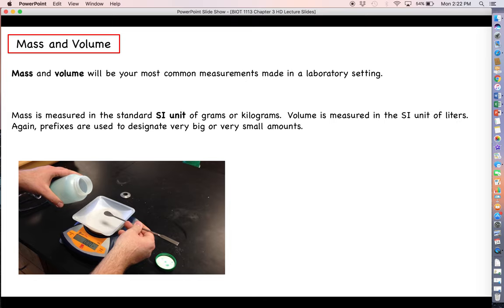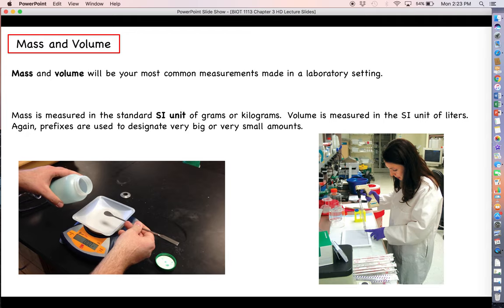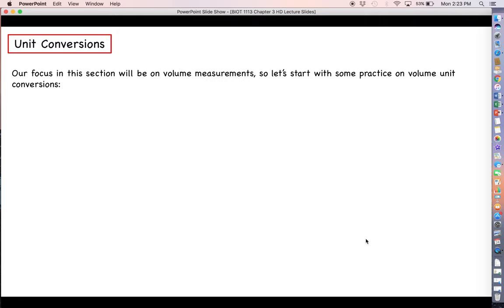Mass is usually measured by an analytical balance or other type of scale. In this picture you can see someone weighing out a particular amount of a solid, using a plastic weigh boat to contain the solid. The analytical balance tells us how many grams or milligrams are being weighed. Volumes are typically dispensed in several ways; here you see a 50 milliliter serological pipette. This operator can pull a certain volume of liquid into the pipette using a motorized pump, then dispense it into another container.